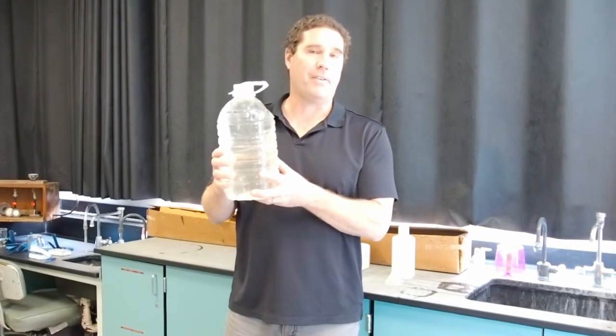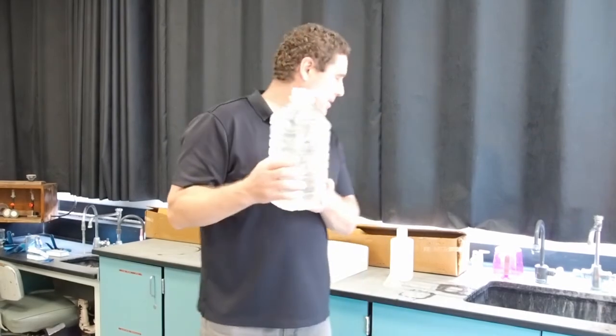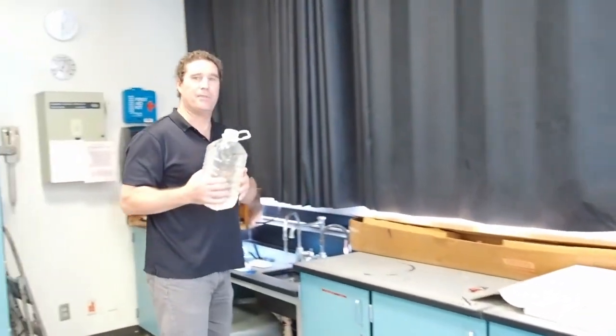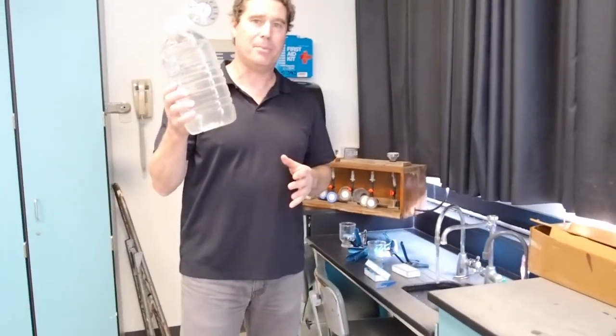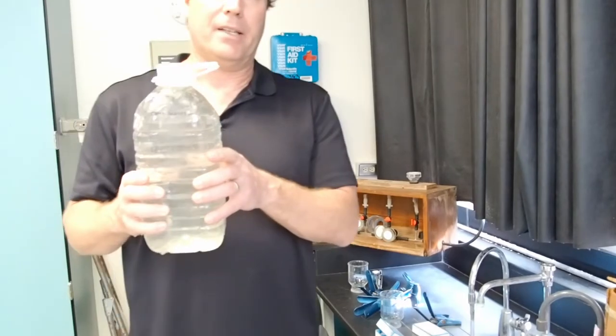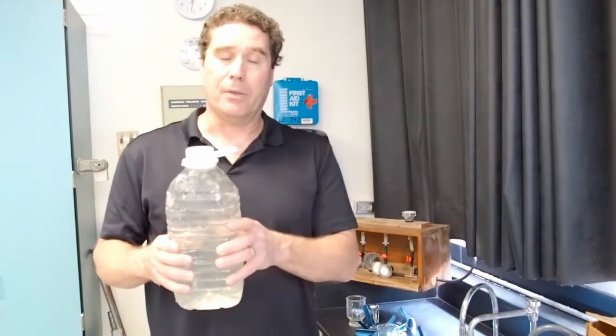So we're going to show you how we go ahead and process this sample to quantify how much chlorophyll is in it. So we're going to go over here to our filtering apparatus. The first job is going to be to take this water sample and filter it down to try to collect all the phytoplankton that are in this sample on a filter that we can then process for chlorophyll.